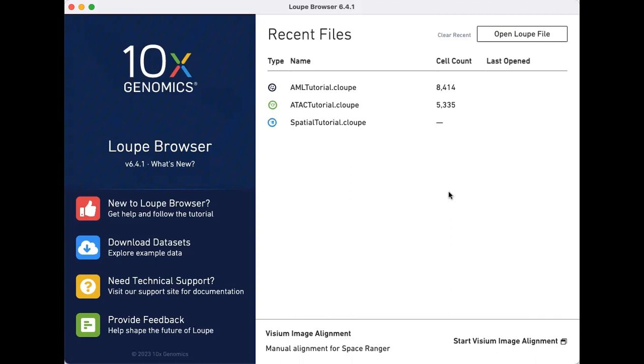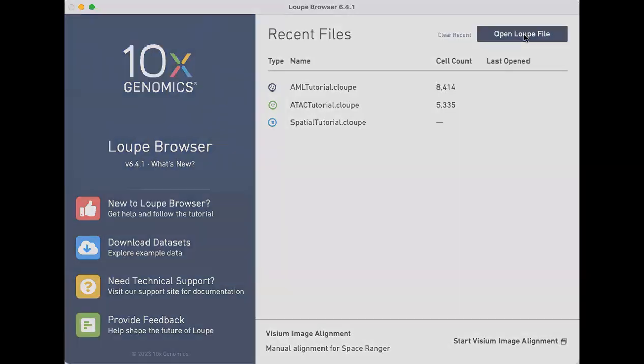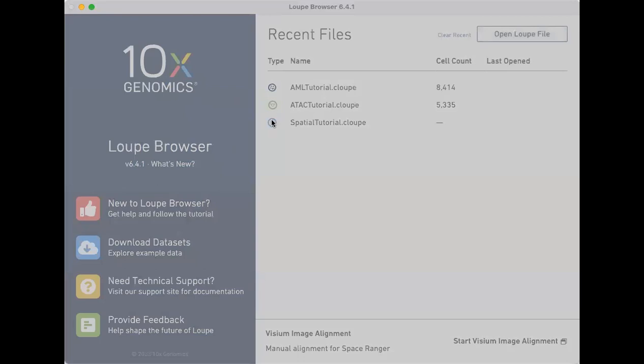We will start by opening up the loop browser and clicking on the open loop file button to select and load the correct C loop file.